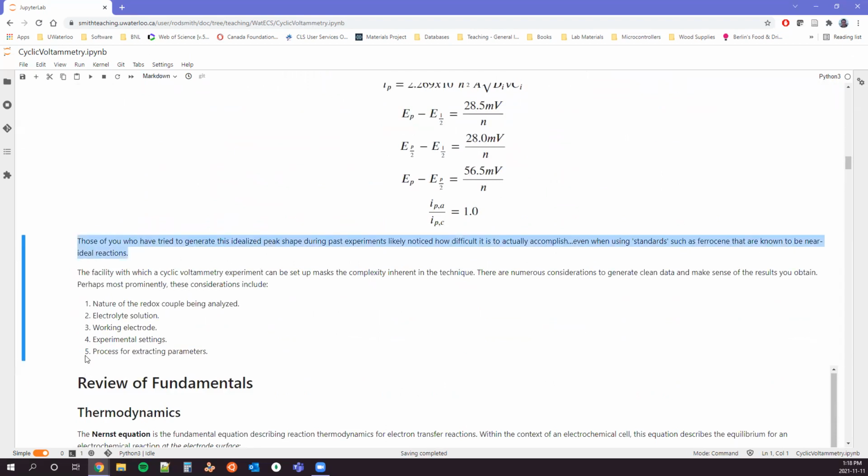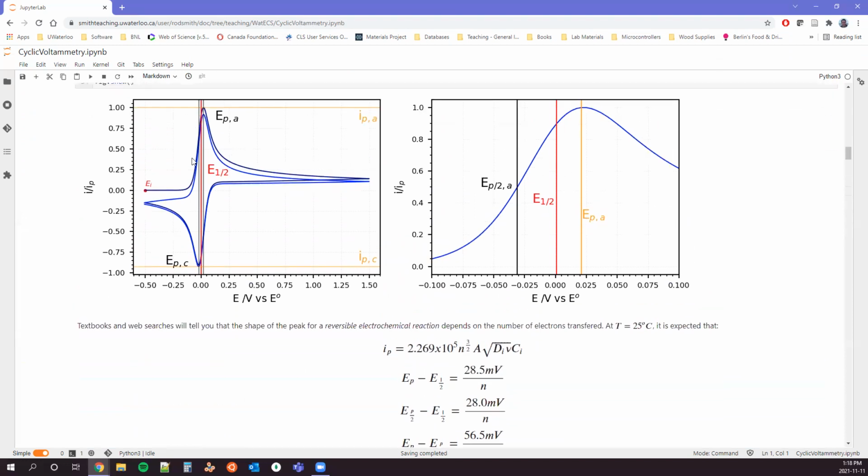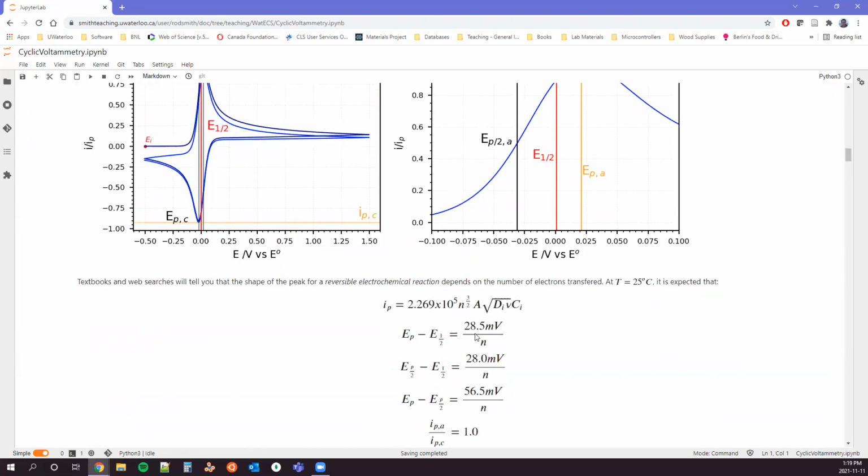And so you'll see experimentally when you go in, it can be quite difficult to generate this. Even if you take something like ferrocene or ferrocyanide and try to generate this nice, perfect, reversible structure, it can be very challenging, right? The quality of polishing of your electrode surface, the cleanliness of your solution, the purity of your redox couple, all of those factor in, right? And so it's very easy to skew away. And this data, you can see too, is skewed away from this absolute perfect.